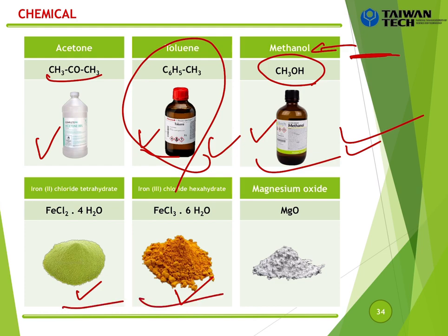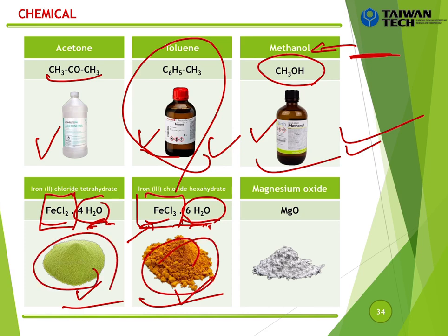So you can see just a little bit different, and you can have the difference in color. And actually this one we don't care too much because this just depends on the properties, and we have some water accompanying this one, because we can also prepare this chemical, but when you prepare this chemical and you sell it to people, water can absorb and change it to this one, okay. So usually when you buy the chemical, they will sell you this or this, okay.